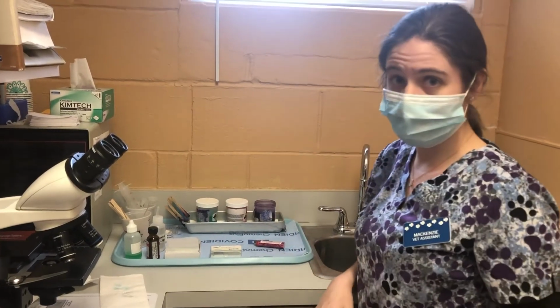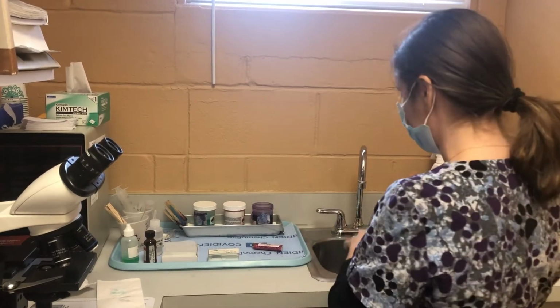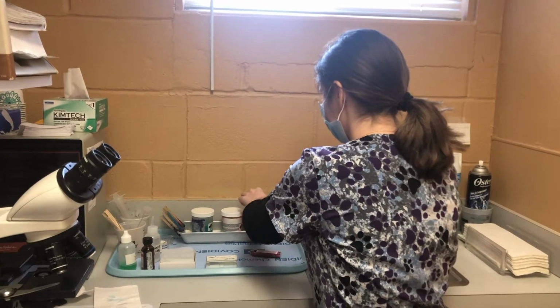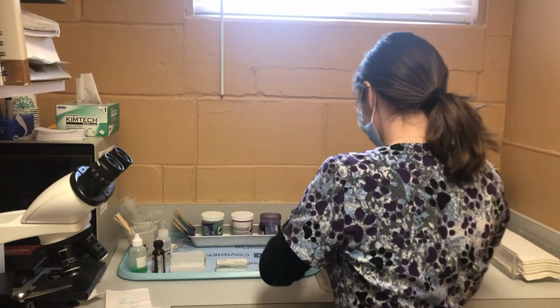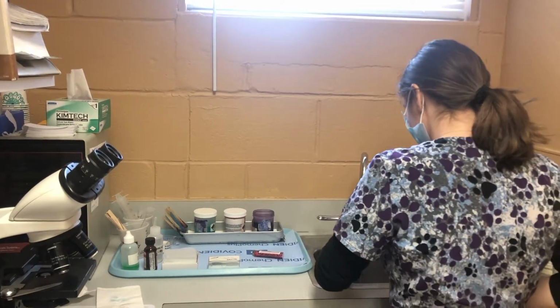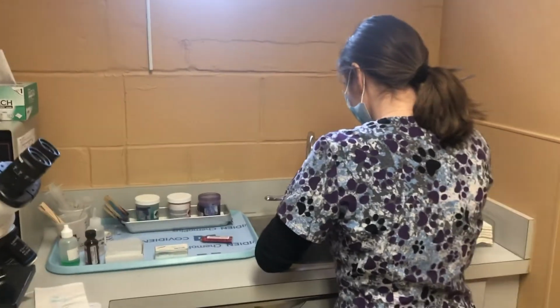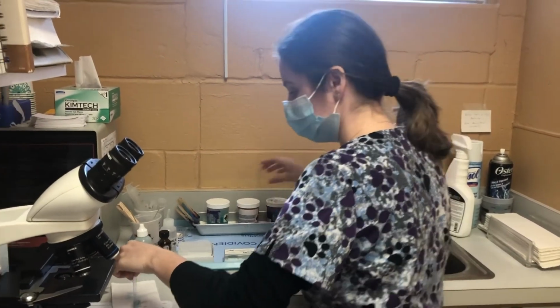And then after that I'm going to get rid of any excess stain that's on my slide by putting it under the water. And I'm going to dry it using my hair dryer over there.